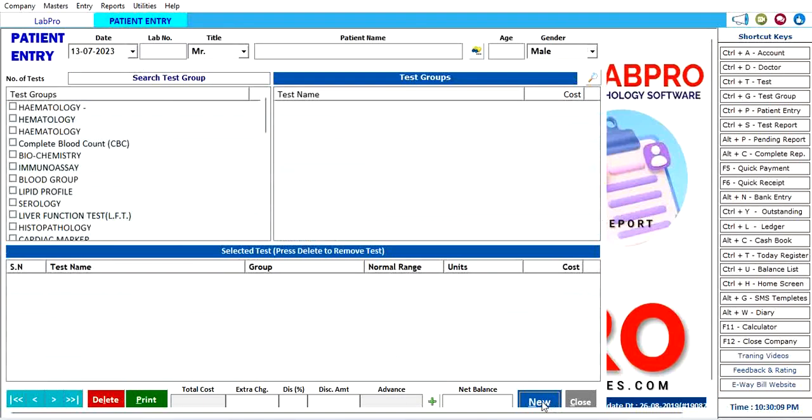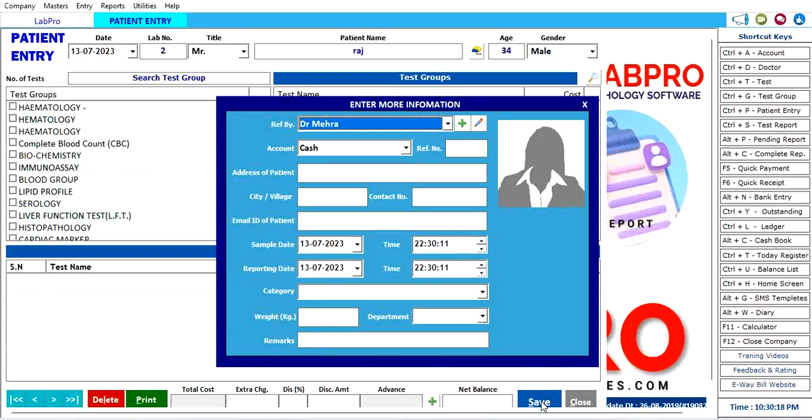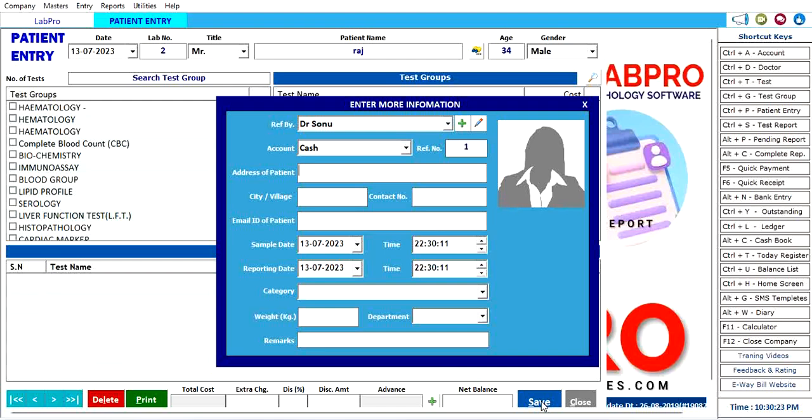To enter a new patient entry, simply press New Entry. Put the name of the patient, select the doctor you wish to refer, write the reference number if you have, address, and contact. Mobile number is mandatory.